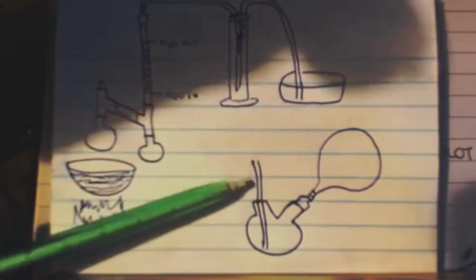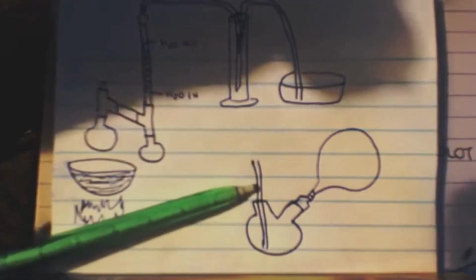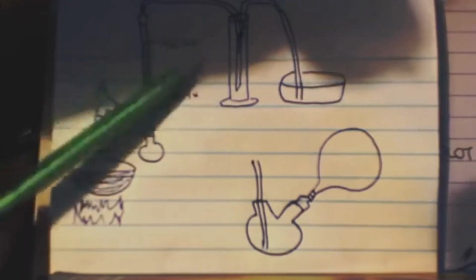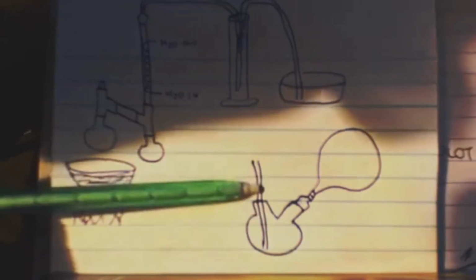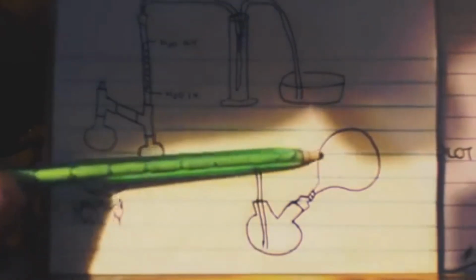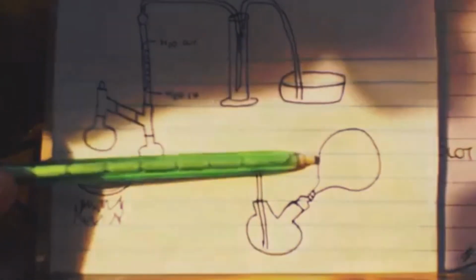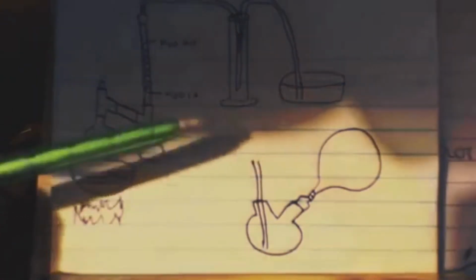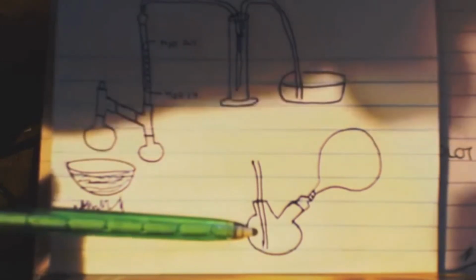But if you did, you'd have to have a valve here and a valve over here. That way, as soon as you close this, like a second later, you can open this, and that way you won't have pressure building up in the system. Then this way you can leave this closed, right? You don't have to worry about suck back. You have your balloon on there. It builds up a higher pressure, even though it's just a little bit more pressure, because of the elasticity of the rubber. And obviously, then the gas will be more soluble in the liquid with the higher pressure.